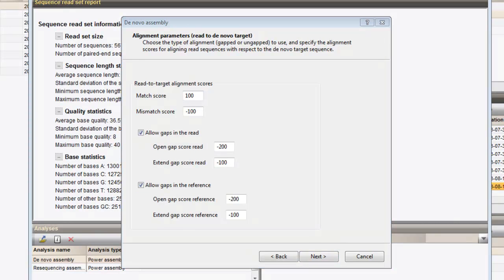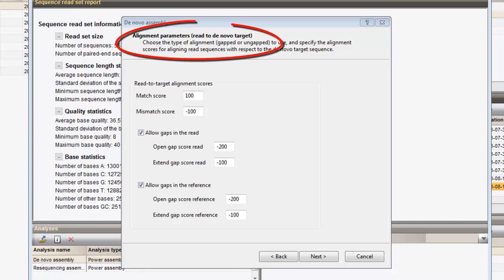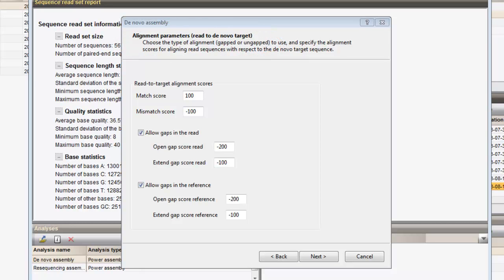When the de novo contigs have been calculated by Velvet, the reads are mapped onto the created contigs. On the next page, the type of alignment can be specified. For this example, we can leave the default settings.